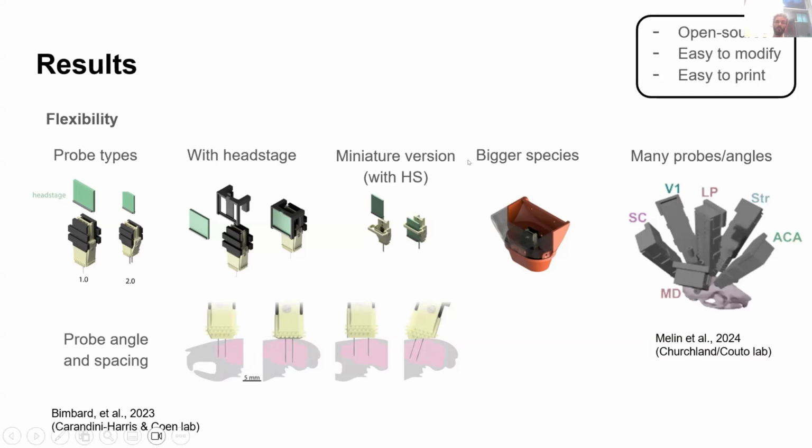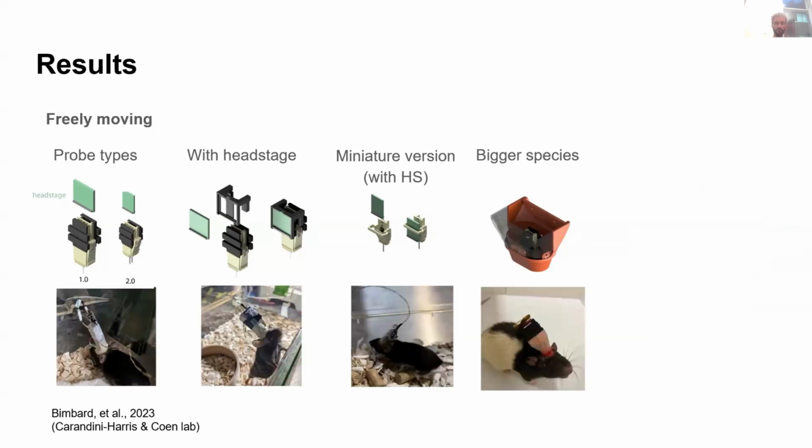Okay, and usually one of the features that I find pretty interesting is that these implants are 3D printed and everyone can modify them. And actually in our GitHub place, people upload the modifications they've made, so it's kind of a community-driven thing.